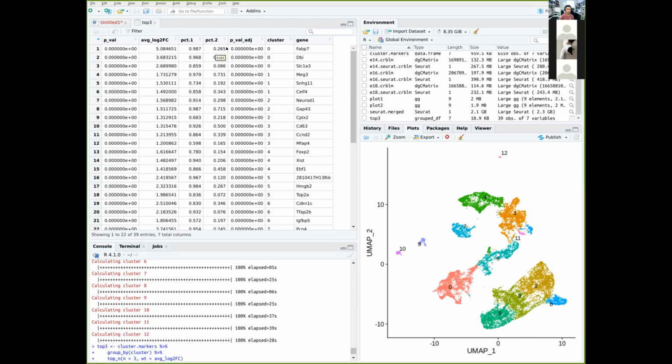Currently, the difference is quite large for the first gene, but for the fourth gene, it differs by about 25%. So if you want to find something which is highly expressed in one, but very lowly expressed in the other, like for example the third gene, this is a very clear difference. So you can use dplyr or other data manipulation to select genes which are highly expressed in one, but very lowly expressed in the other one. That's another tip from me.